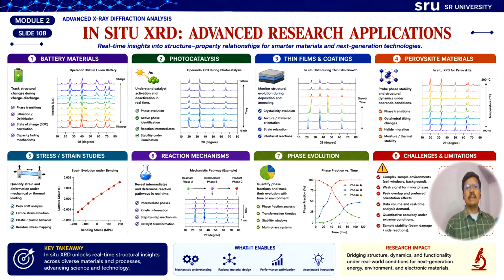In situ XRD helps to analyze the textural evolution, grain growth, and stress relaxation. This is highly important in semiconductor devices and advanced coatings.